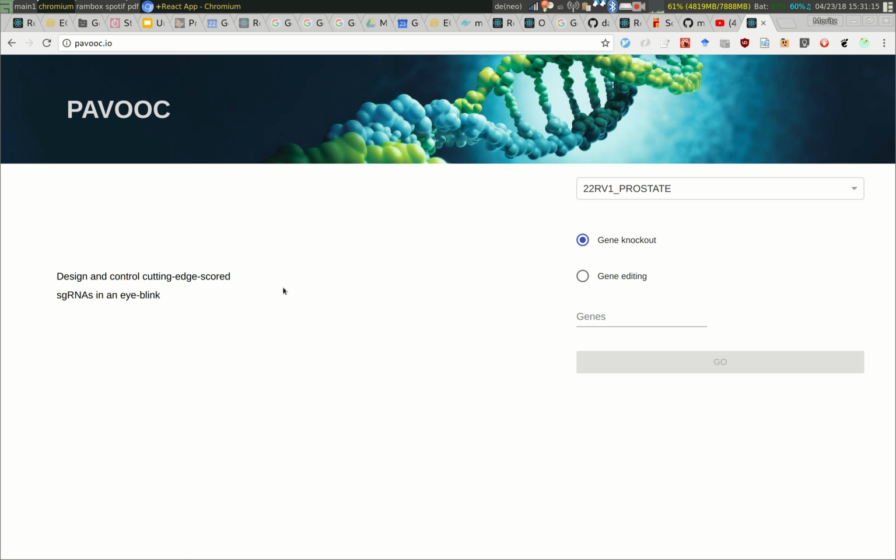Hello, in this video I will present you the web application PAVOOC and explain how you can use it. Using PAVOOC, which stands for Prediction and Visualization of On and Off Targets for CRISPR, you can design domain-aware CRISPR sgRNAs for gene knockout and gene editing experiments.